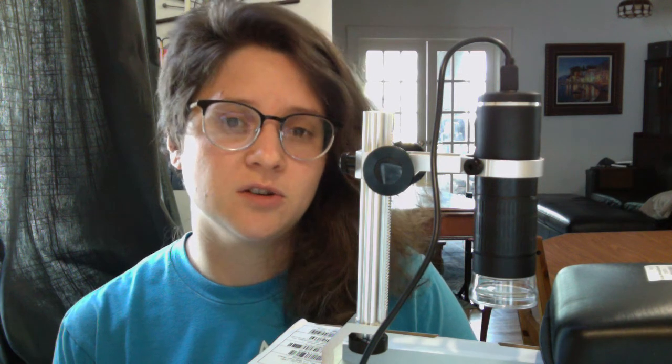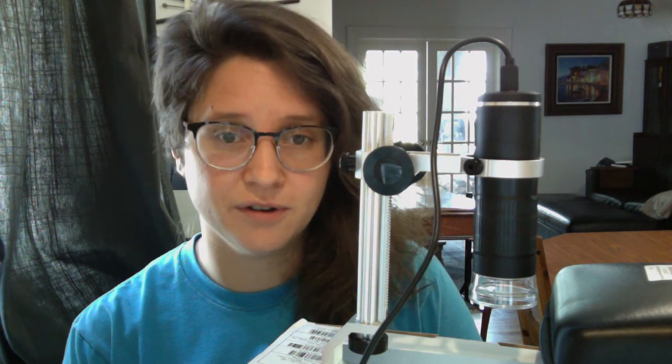If you go lower than that price range, there are certainly digital microscopes. But the problem with those is that they're really just the microscope on a gooseneck. I find that the gooseneck ones, although a lot less expensive, are really much harder for students to practically use and to actually focus. So I specifically wanted something that has a stand that is kind of like a stereo microscope stand.